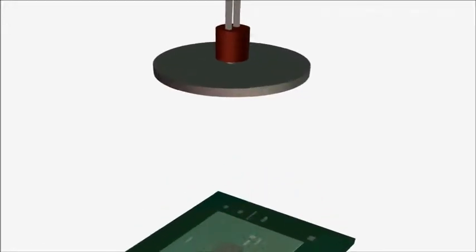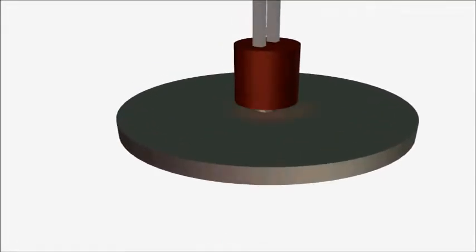There's no lens. Just like I bring my hand close to the table, if you bring the cells close to the CMOS imager, you will capture their shadows. What is different between my shadow and a cell's shadow is cells are semi-transparent because they're small. They're a couple of microns. So light can penetrate through and scatter from the three-dimensional body of the cell and cast a unique fingerprint-like shadow.